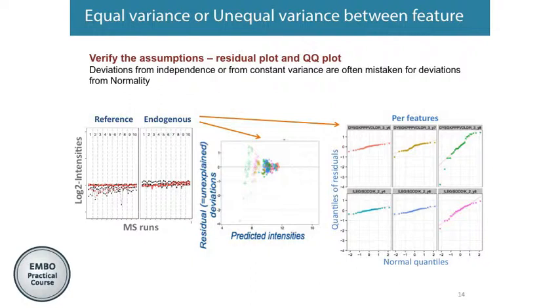And then on the right side, somebody asked me during the break how often the assumption of normal distribution is appropriate. So these plots are very frequently used in statistics in general to diagnose if normal distribution is appropriate or not. On the x-axis, you have the values that you would expect from normal distribution. On the y-axis, you have the values which we see for these residuals. So essentially, if it's a straight line, it means that normal distribution is okay. If the points deviate from the straight line, it means that normal distribution is not the best choice here.